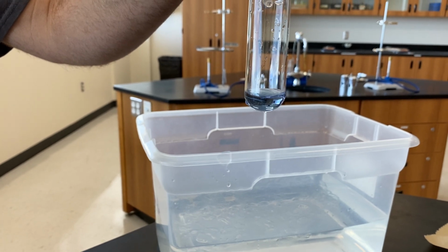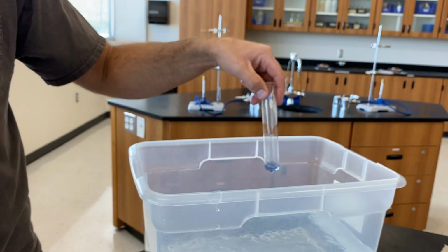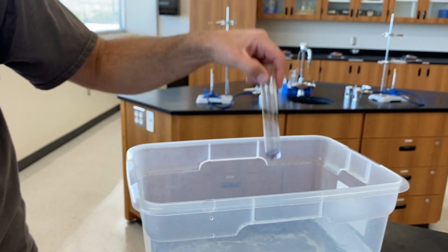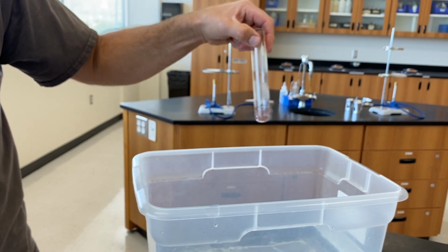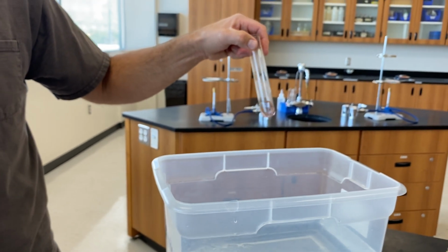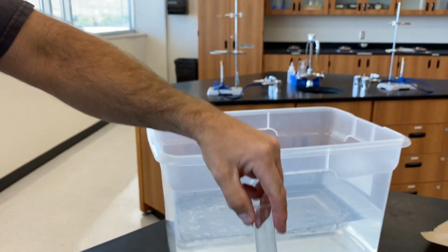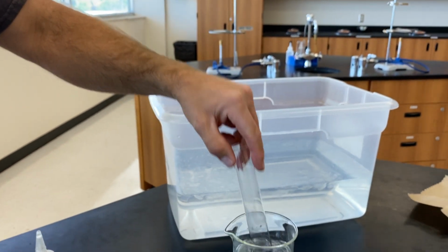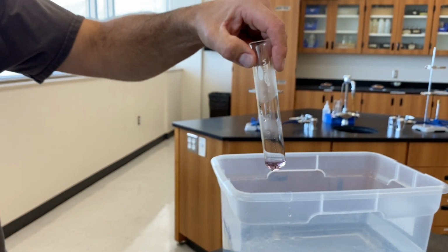Yep, that's our blue. Okay, so now I'm going to cheat again, and I'm going to move it back to purple by cooling it down in some cold water. All right, so now we're back to our purple color. Does that look purple in the camera? Maybe I went a little too far. That looks a little pinkish. Yeah, maybe I went a little too far. That looks purple. There we go. All right, so now we're back to purple.